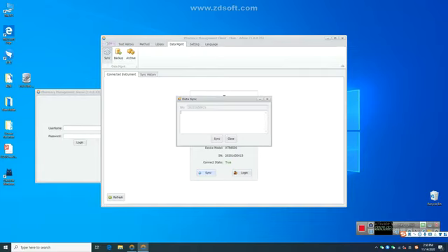now is waiting. You can see on the computer screen the synchronized processes. Usually, synchronizing the libraries will take a longer time if your library is large, and when synchronization is complete, you can see synchronized complete, and now you can close it. So that means the database synchronization has completed.